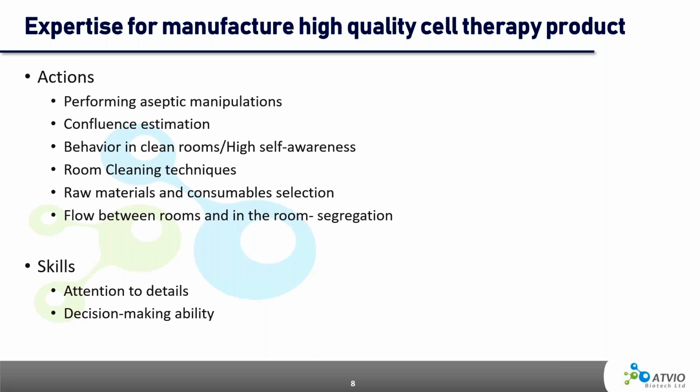About expertise, usually the knowledge transferred to a new team member is trainer dependent, but it's the little things and attention that will make the difference and allow us to produce a high quality product. When the training and qualification process is performed by the same team of experienced people all the time, the details won't be missed and you get aseptic technique robustness and consistency.